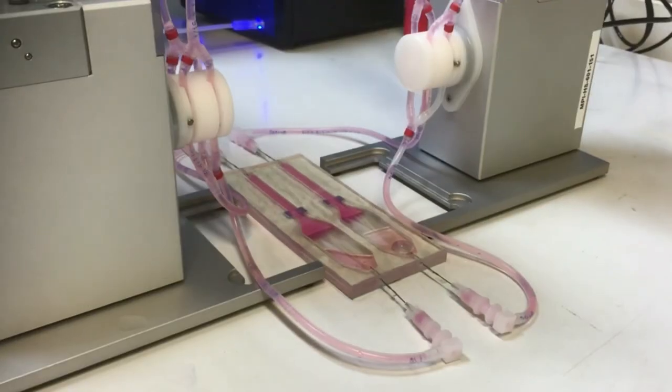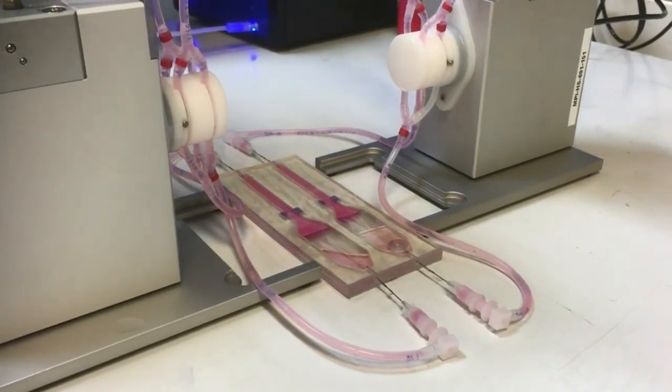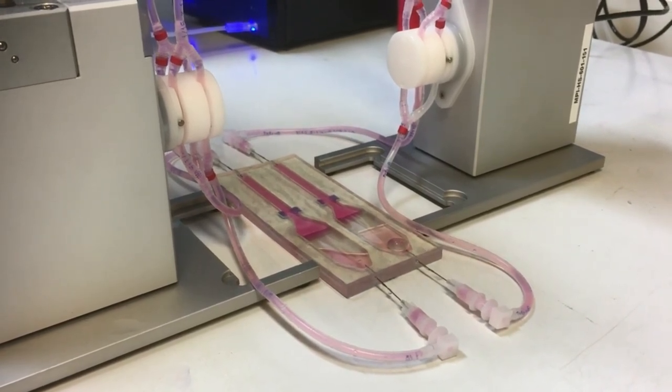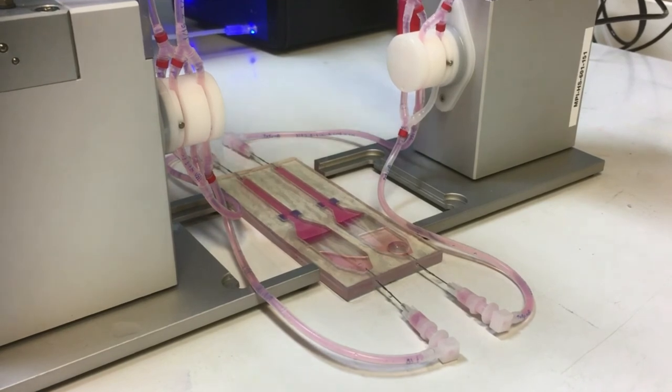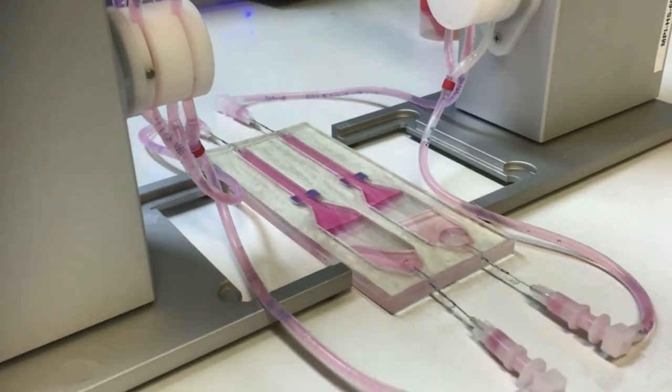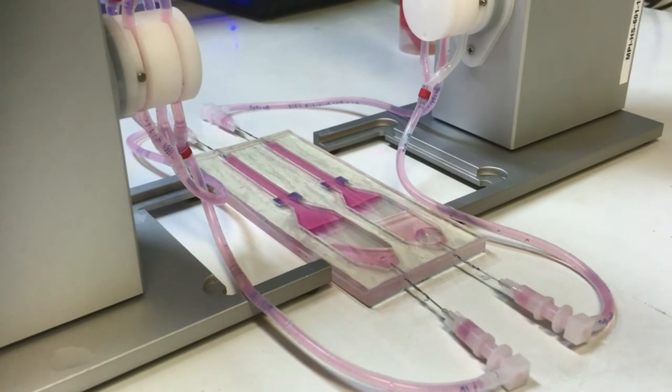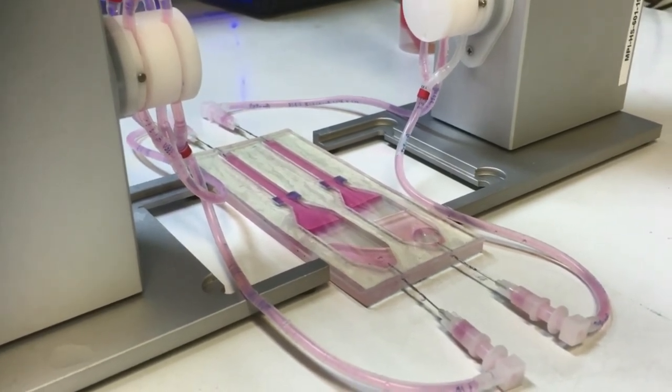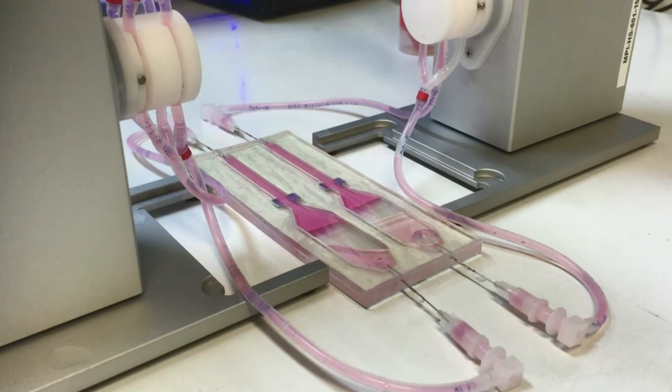Further experiments, such as proliferation assays of the 3D culture and toxicity studies on the chip are necessary to evaluate the suitability of the system as an enhancement to the current 2D in vitro cytotoxicity assays. In order to establish our process on larger scale, a transfer to an automated 3D bioprinting system would be necessary.